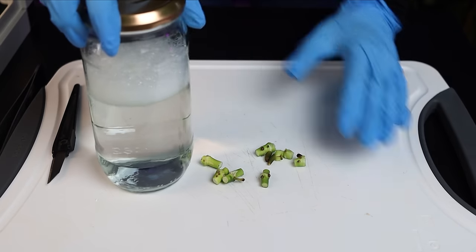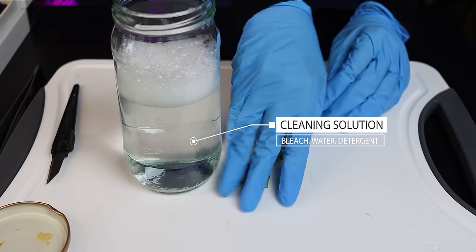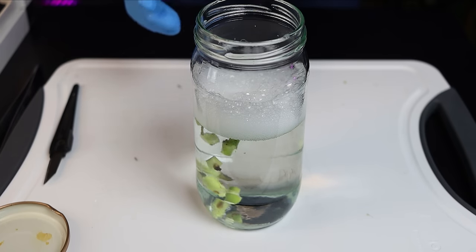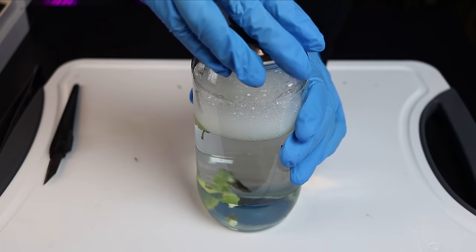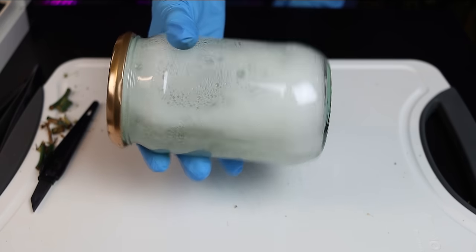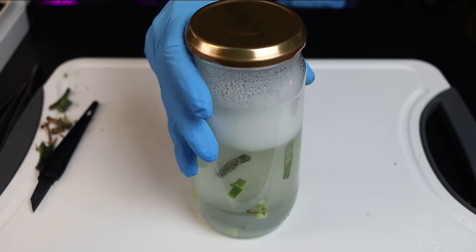It's time to clean the nodes, so I'm washing these in a solution of 10% bleach, a little bit of water, and a little drop of dish soap. Now why dish soap, you may ask? Basically, it breaks the surface tension of the water surrounding the plant material, which allows the bleach solution to penetrate all the nooks and crannies and sterilize the plant material. I'm going to leave this to soak for around 15 minutes or so, and I'm going to agitate it every few minutes just to make sure everything is nice and clean.